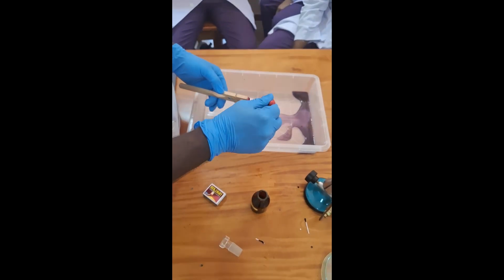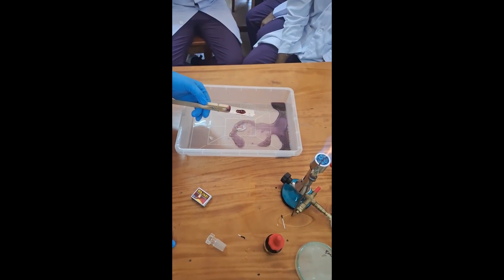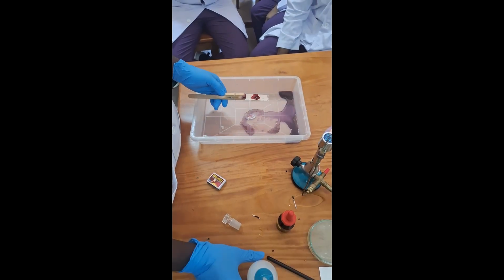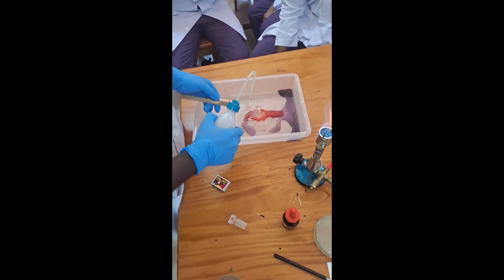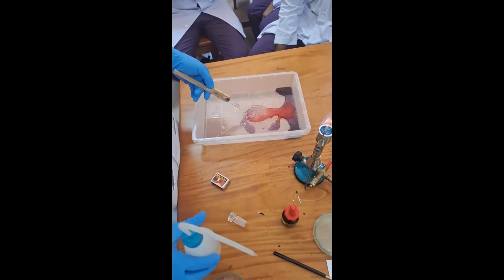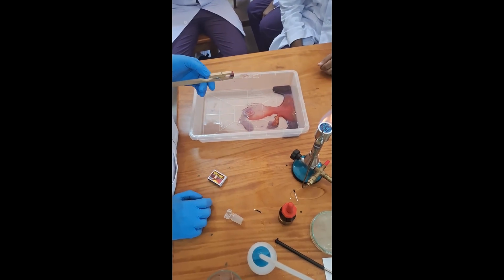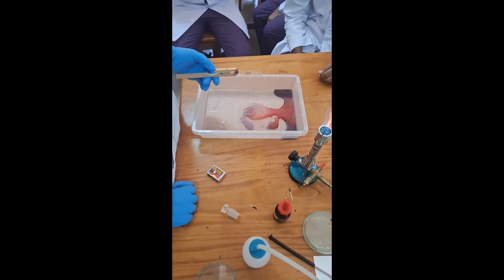Flood with safranin and leave for 1 minute. Safranin stains Gram-negative bacteria pink because they were decolorized by ethanol, while Gram-positive bacteria remain purple due to the crystal violet iodine complex trapped in their thick peptidoglycan layer, giving a clear color contrast for differentiation under the microscope. Rinse gently with tap water for 5 to 10 seconds. Air dry without blotting.